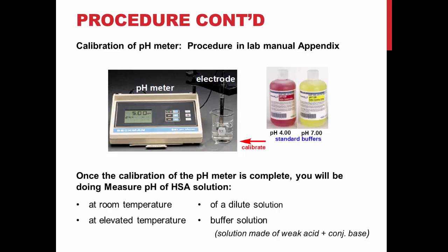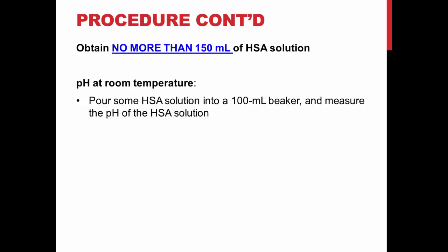Once your pH meter is ready to go, you will measure the pH of a sample of salicylic acid stock solution at two different temperatures. First, take some stock solution in a 100 mL beaker and measure the pH at room temperature.